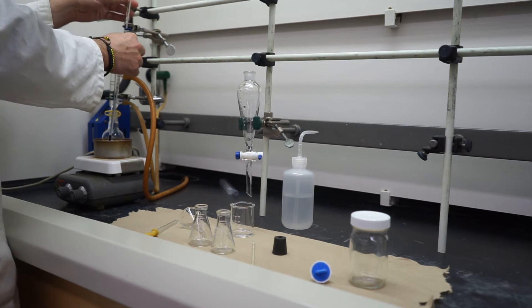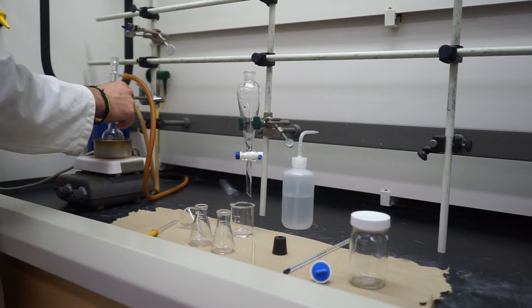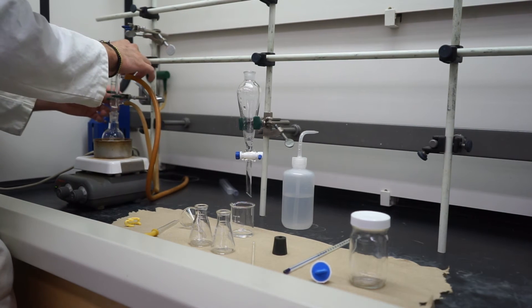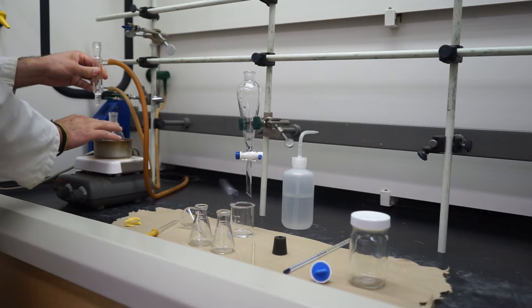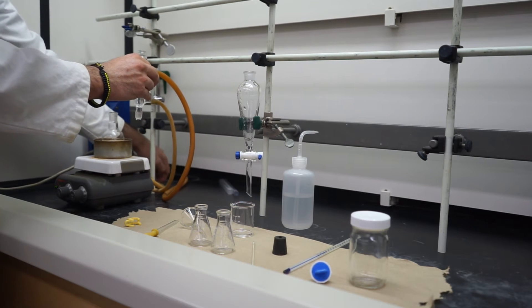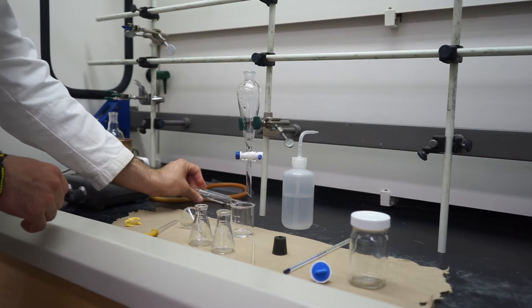First things first, let's move our thermometer out of the way. If it's a little warm, we'll just move it. We'll put the thermometer on a paper towel and make sure that it's not touching the surface directly, because that could cause a problem. Now we'll take off our Keck clip, move it to the side, and then take our water-cooled condenser and remove it, making sure not to spill our product. Then we'll take out the latex tubing and dump the second one into the sink in the back. If we turn this upside down, most of the water should just pour right out. We can leave it there until we're ready to finish cleaning it.